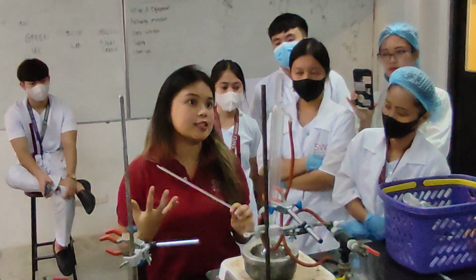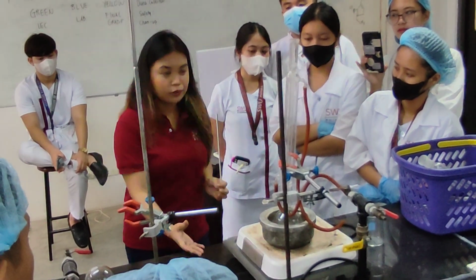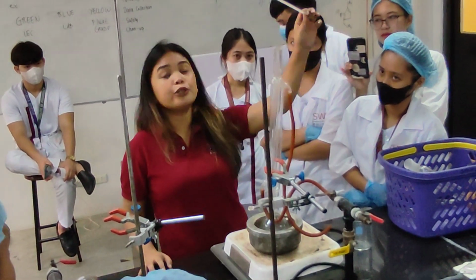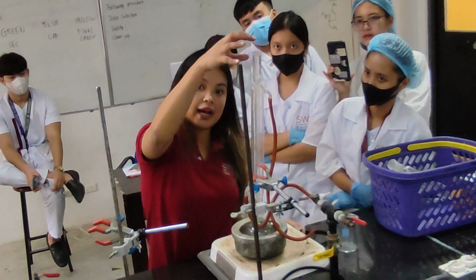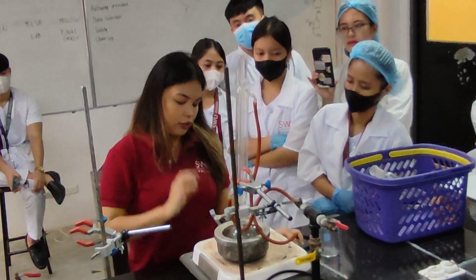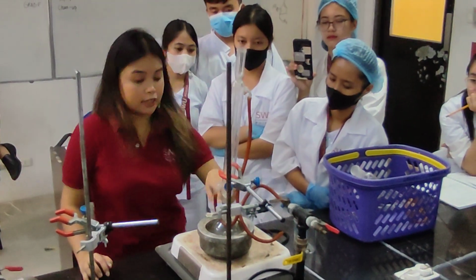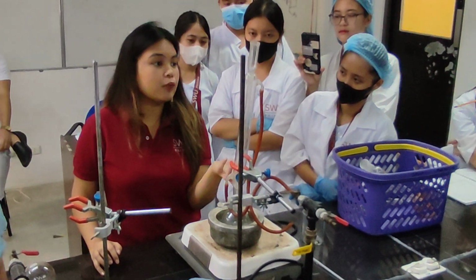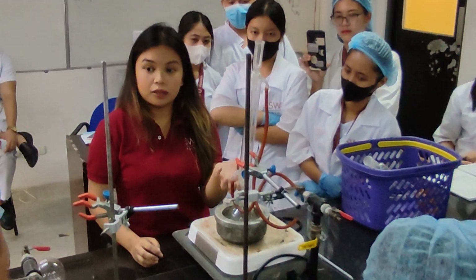So how will you know if it is 50 degrees Celsius? If you are using a Bunsen burner, you don't know how to measure, so you put in your thermometer. But most of the time, it is left open. And then you just use your hot plate. Now, what happens, guys? It boils here. What will happen with the solvent, which is more volatile compared to your solute?